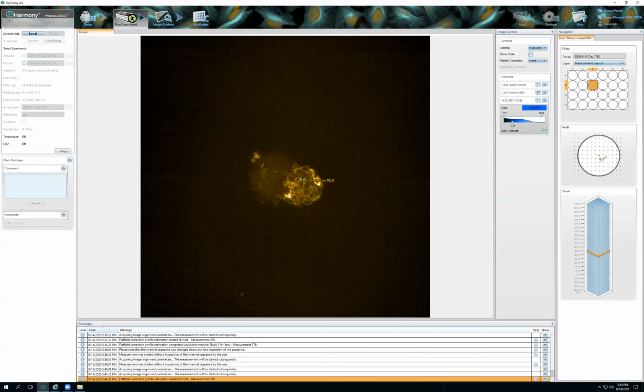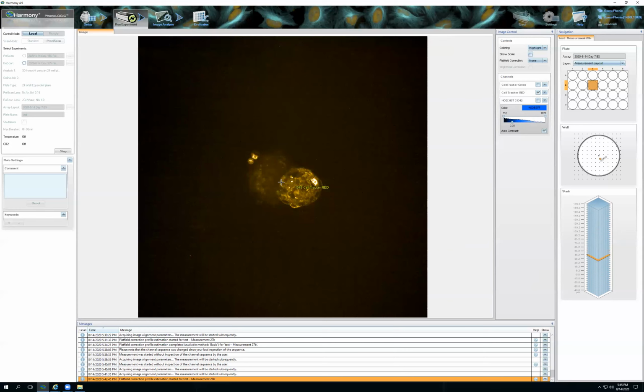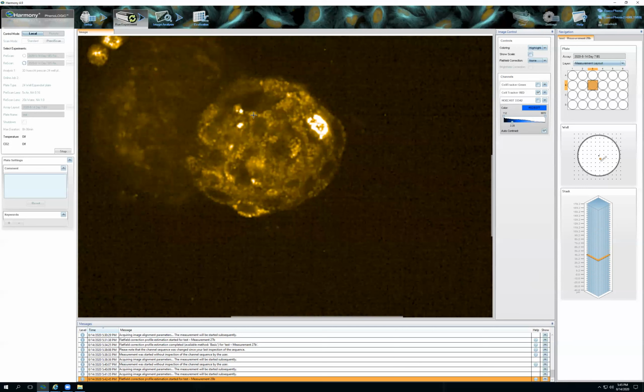I can try to increase the time of the laser power just to see if I can get these numbers up any. Because again, ideally I want them above 2000 all across. And this stain is kind of grainy, so it's hard to tell if you're on the exact spot or not. You can use your mouse to zoom in to see for sure. But this doesn't mean it's overly expressed. It just shows that this white area, the intensity is higher.